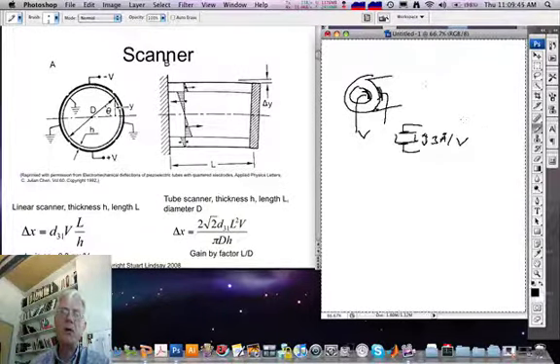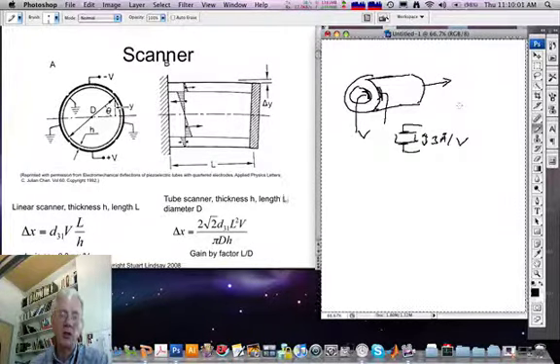However, because of the tube geometry, and remembering that this material has to pretty much keep its volume constant, if we contract the walls of this tube, then the length must increase. And rather like squeezing on a tube of toothpaste, there is a geometrical amplification to conserve the volume of the toothpaste, and in this case the volume of the PZT. That means that the sensitivity in this mode is often on the order of 30 angstroms per volt.